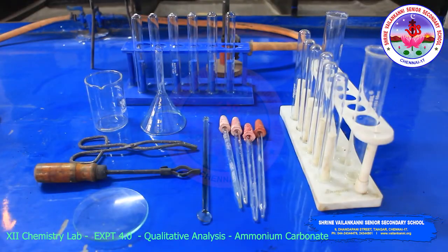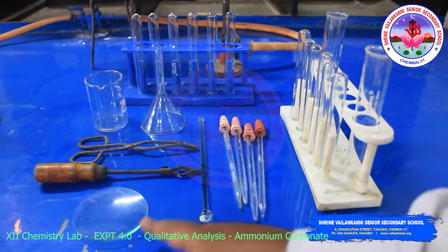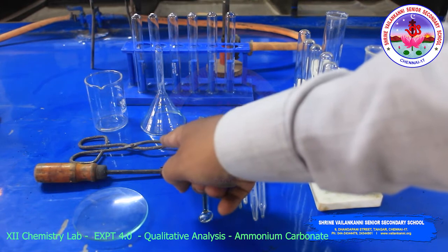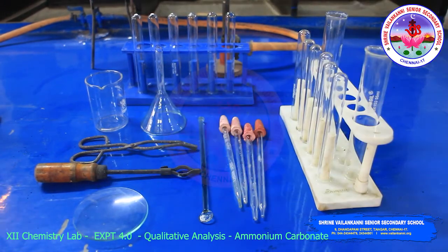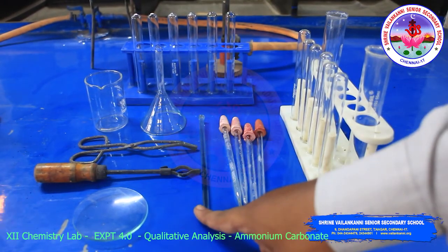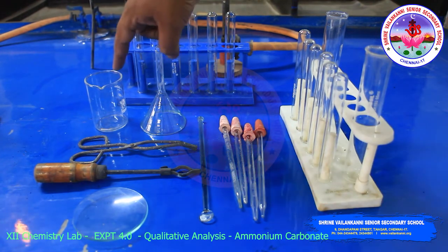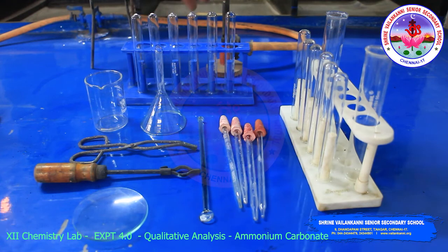Now we will do the experiment, students. Before that I will show you the apparatus for salt analysis. This is a watch glass, test tube holder, tongs, then glass rod, dropper, beaker, funnel.